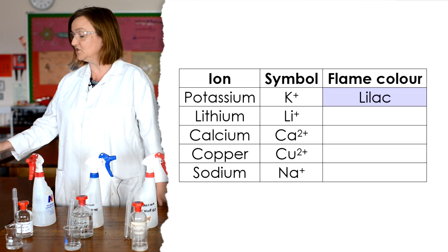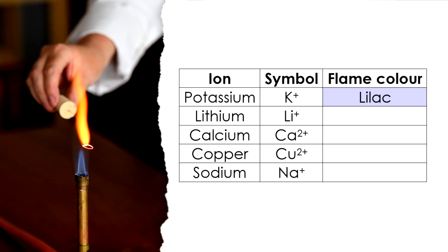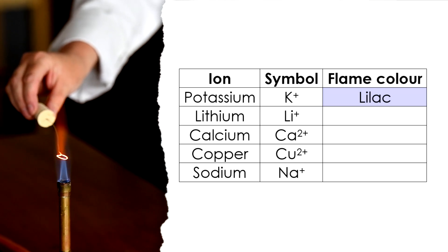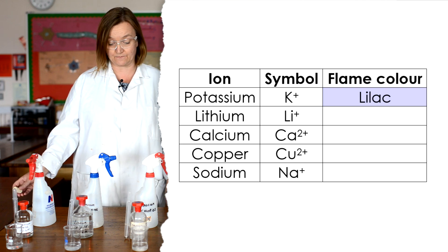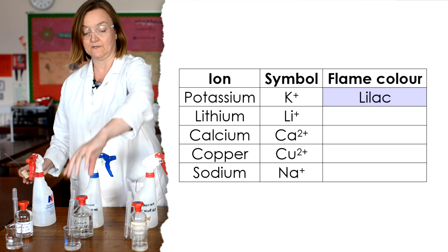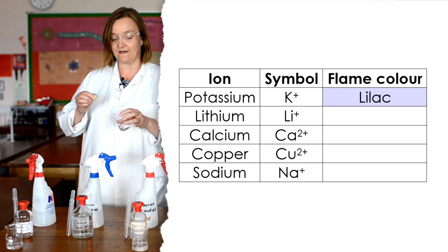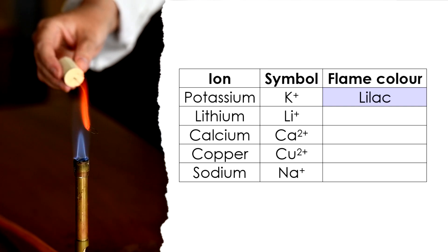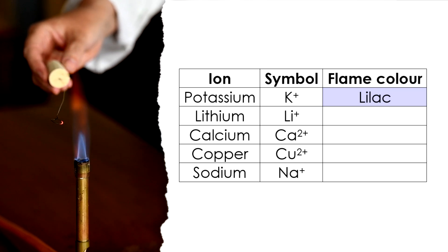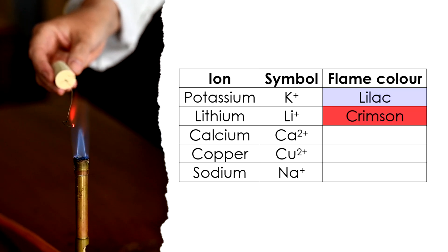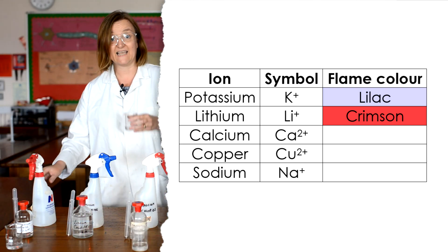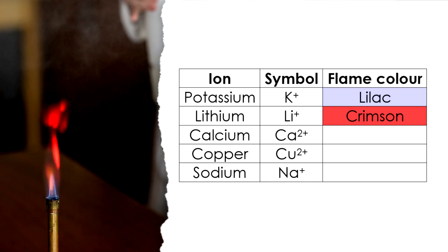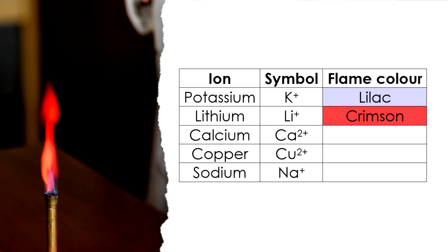Now between each metal, I'm going to just heat my loop right in the middle of the flame till it's glowing red hot like that, and that will just get rid of any metal ions that are left on the loop before I go to metal number two, which is lithium. Now this is also a group one metal, just like the potassium was, but it does give a very different colour. Watch this. There, do you see that really dark red colour? Usually described as crimson, this is very characteristic of lithium. Again, let's try the spray bottle and see if we can see that colour again. So lithium. Beautiful dark red, crimson colour.